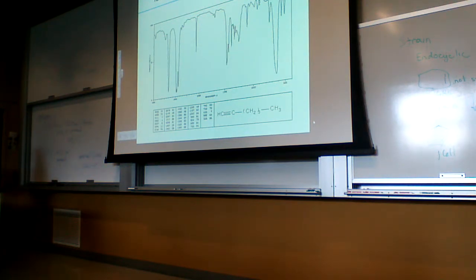That's essentially all we have to look at here. So we have the CH stretch on our spectrum and our triple bond stretch in the 2100 range. When you're looking at these, pretty much the only thing that shows up near that is the nitrile.